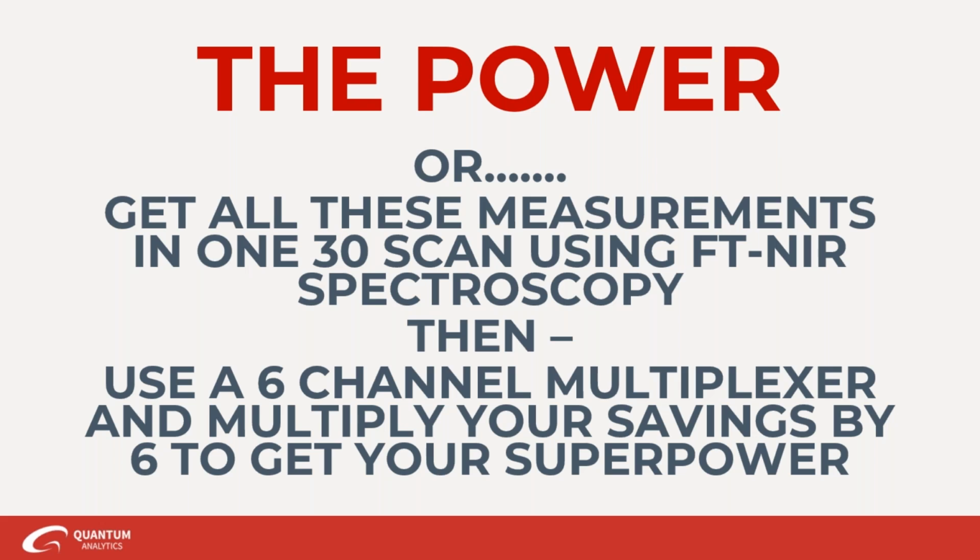From the best of my understanding, using the UV just in practice speeds it up. It makes it go faster, and if that's the case, then getting your readings quickly and fed in real time, as opposed to pulling the samples out and doing the traditional methods, would be more beneficial than ever.